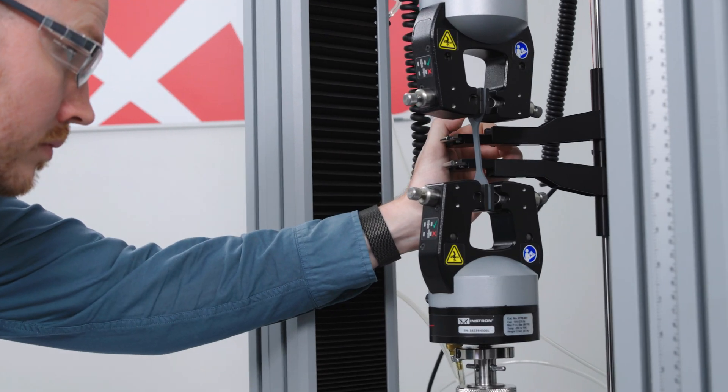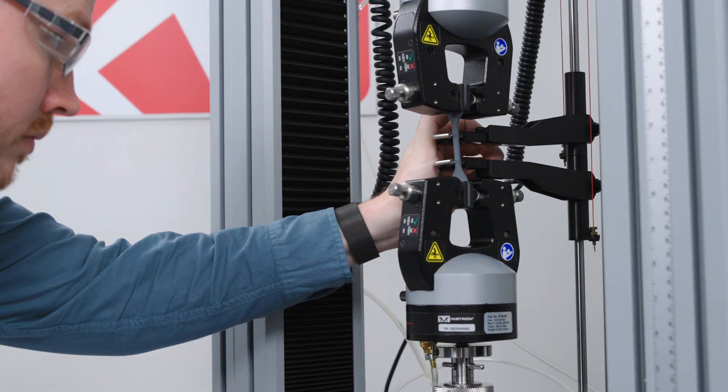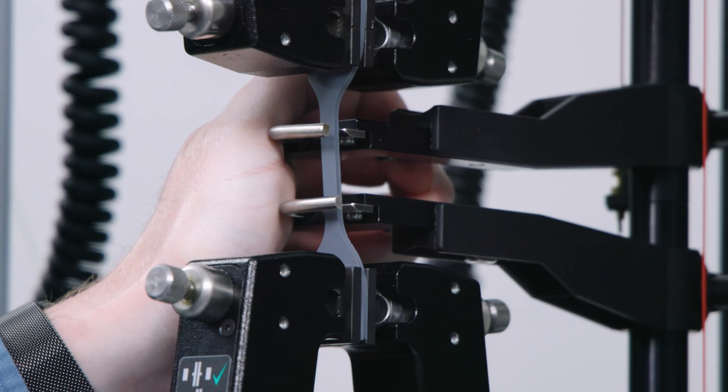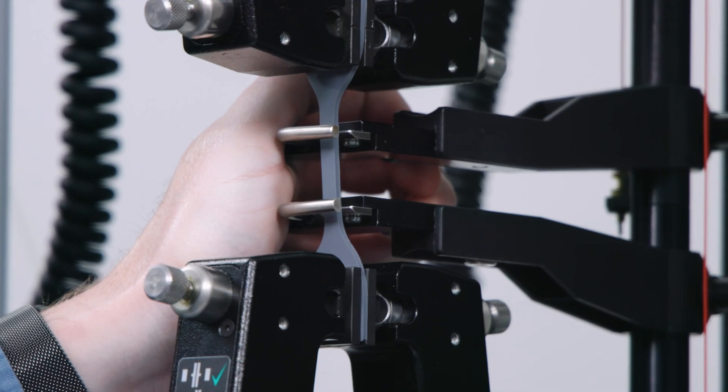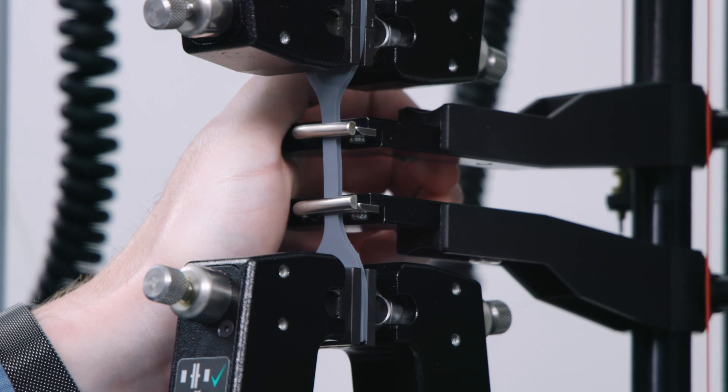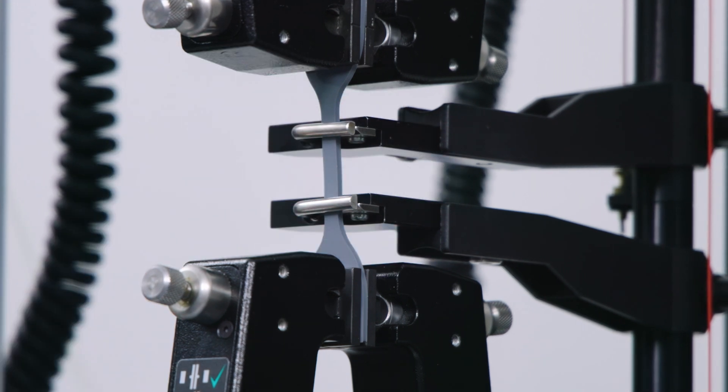The Long Travel Extensometer is easy to use, allowing for single-handed operation to clamp specimens.